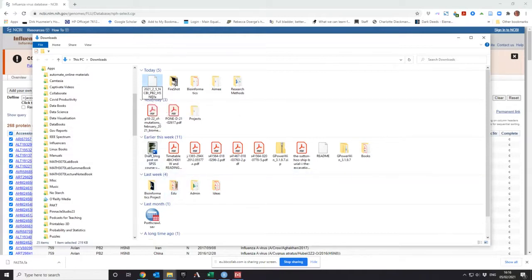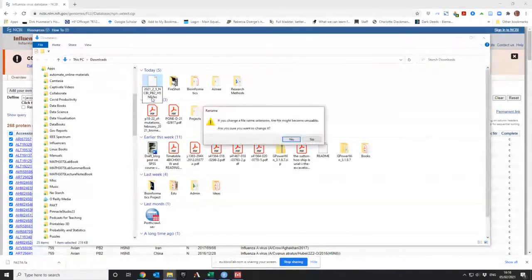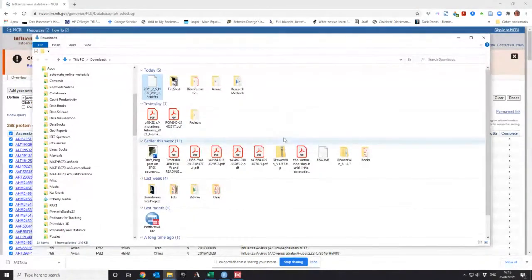H5N8, and I'll put .fas. Yes, I do want to change it. Surprised, because it should have changed. The icon doesn't matter. Right, so I've downloaded the first of those segments.